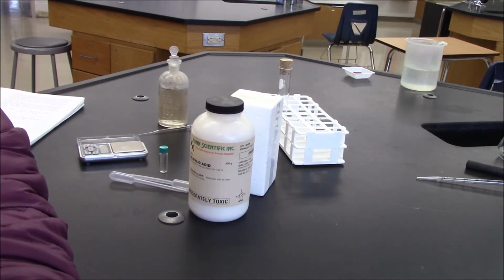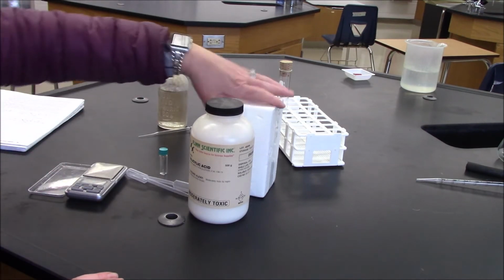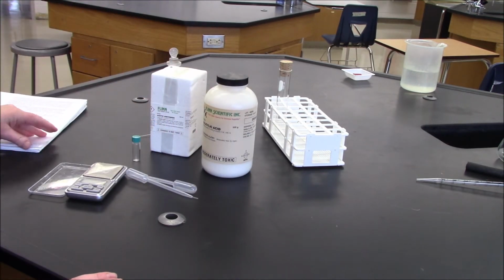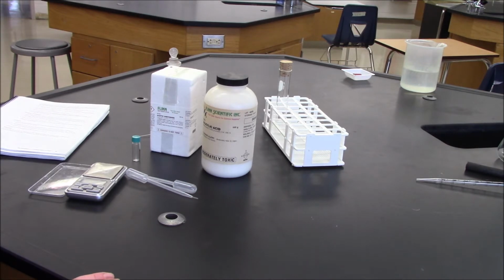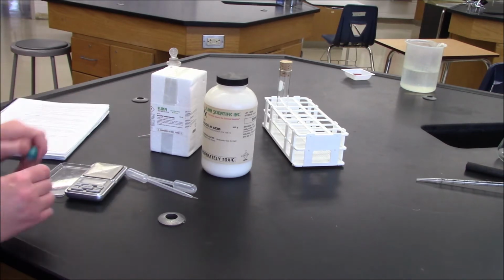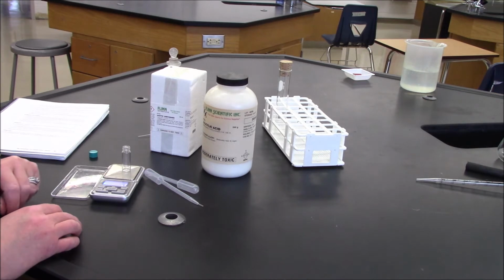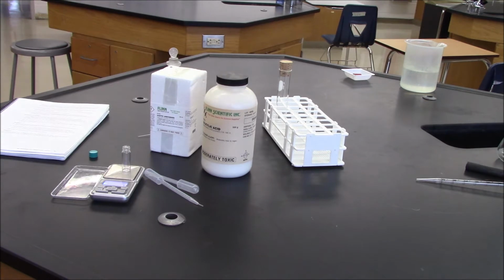In the first step, I'm going to add 1 gram of salicylic acid, and I'm going to add 1.08 grams of acetic anhydride into my small reaction vial. Put this in here, tare it. This opening is very small.